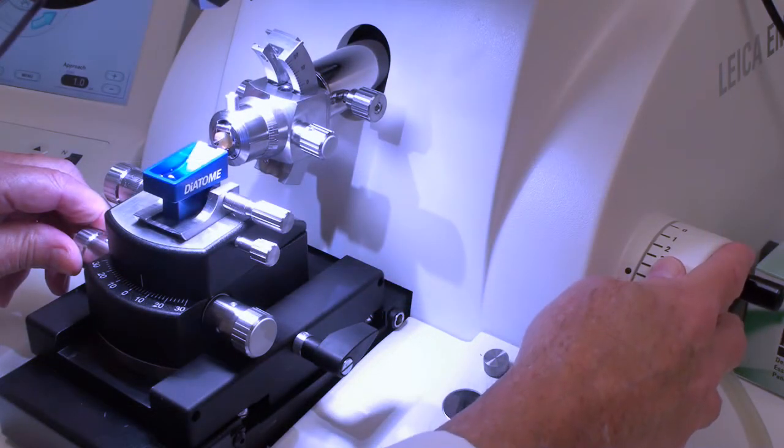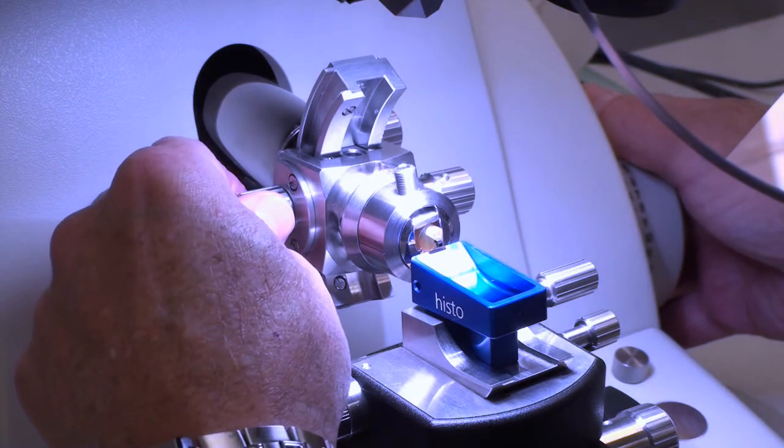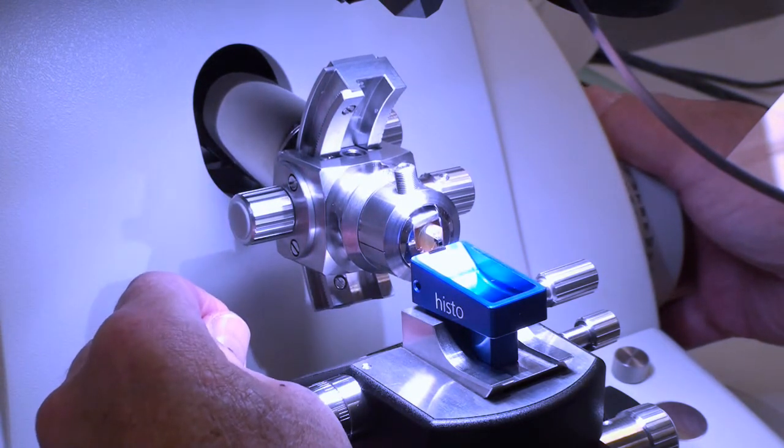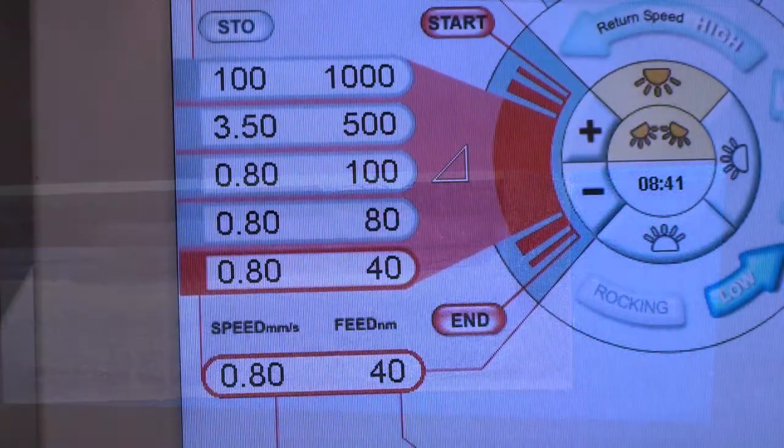So doing small adjustments of your knife arc and then moving it forward a little bit more. And then checking your specimen arc. Make another little adjustment. You want to make sure that that's all very nice and tight so that your block face will section evenly from top to bottom and left to right. And now my line is very small and as I move that down it stays relatively the same length all the time, same thickness.